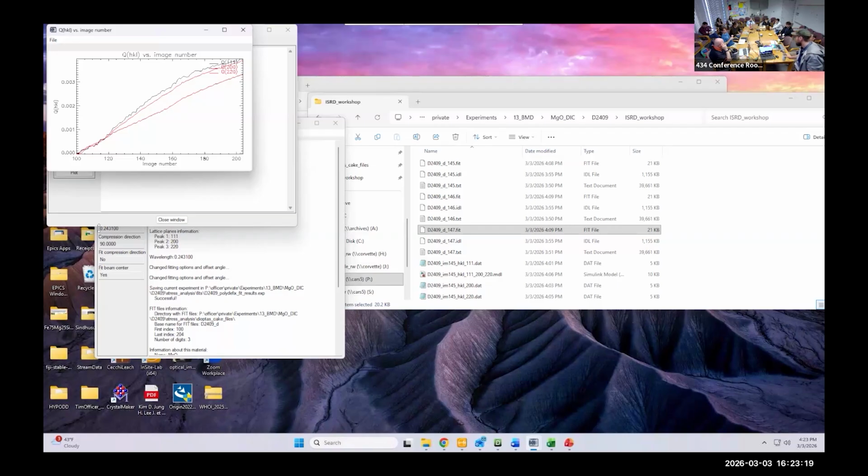Yeah, that's the drawback of the assumption. Assuming that it's an ellipsoid when the only thing that you know for reality is that it is absolutely not an ellipsoid. Exactly. So all of that comes into play. And it doesn't take into account the interactions of the neighboring grains. Yes. You have one grain, you have other grains in there, right? One deforms, all the others have to follow. And in the self-consistent model, that detail cannot be taken into account. So there are so many issues in there.